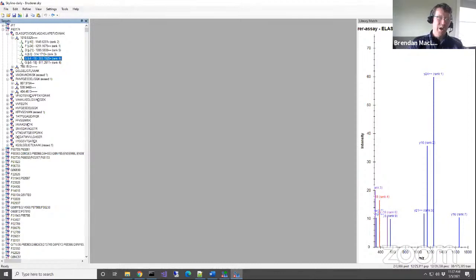The thing about a long peptide is it's also going to have a more complicated spectrum. This is a classic scoring issue in DDA search, in that both higher charge states and longer peptides separate into different distributions.